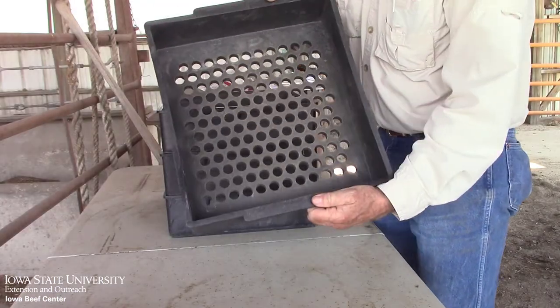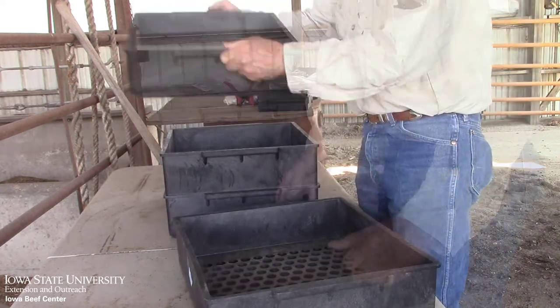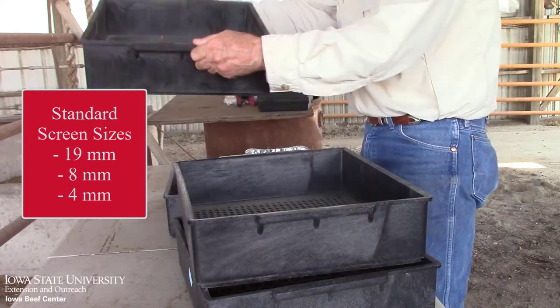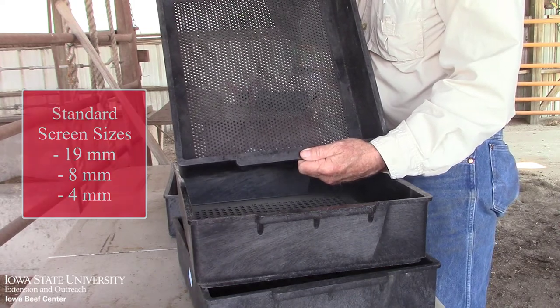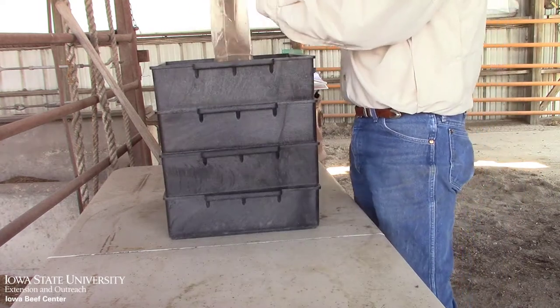The Penn State Shaker Box consists of a series of trays with different sized screens. The standard sizes are three-quarter of an inch, or 19 millimeters, eight millimeters, and four millimeters. The process involves shaking five times from each direction, twice. So let's demonstrate.